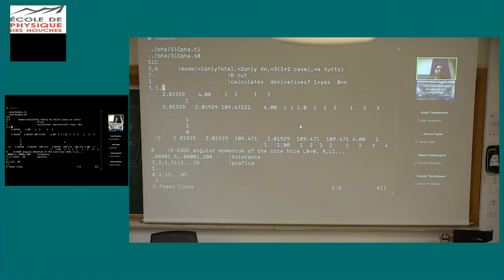So this is the one two-body. Then again we have only one 3-body. So in this case, as before, just put 1, 1, 1, and then these are the input for the 3-body, which are the two distances and the angle between them. This is the degeneracy, and then this additional parameter is if you have some permutation or something, and then the last one is which phase shifts will be used.